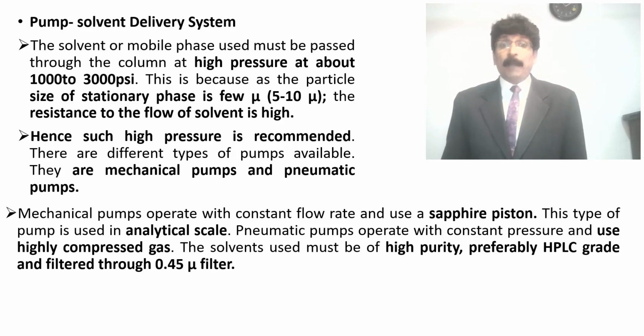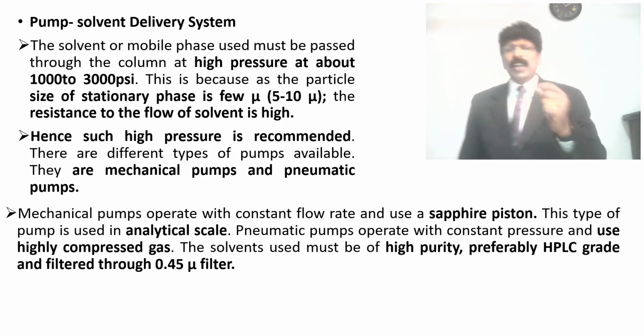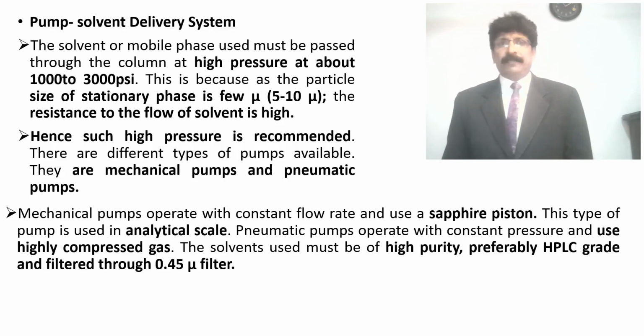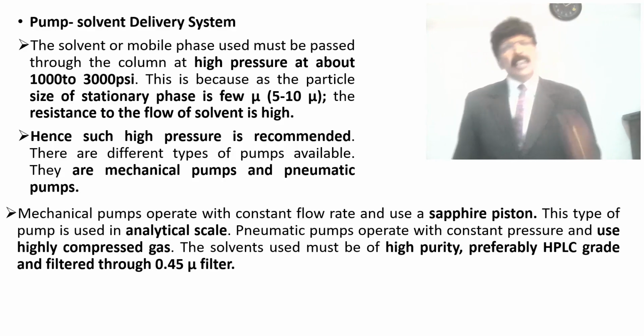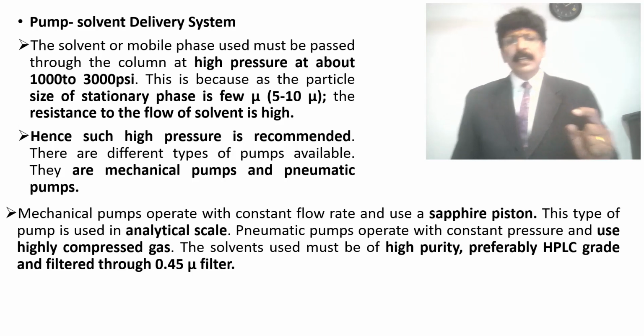There are different types of pumps available. There are mechanical pumps and pneumatic pumps. The mechanical pumps operate with constant flow rate and use a sapphire piston. This type of pump is used for analytical scale. Pneumatic pumps operate with constant pressure and use highly compressed gas.